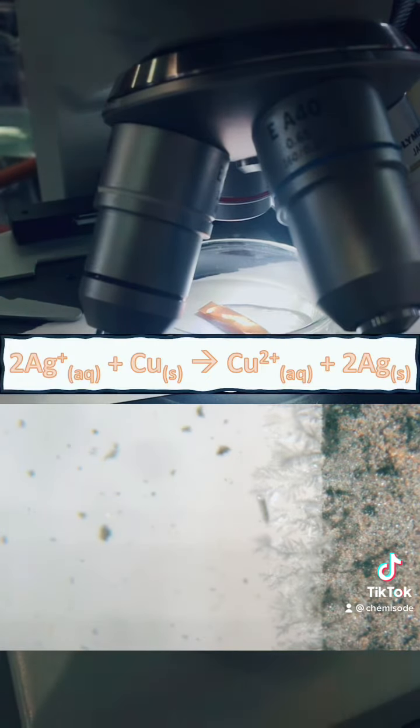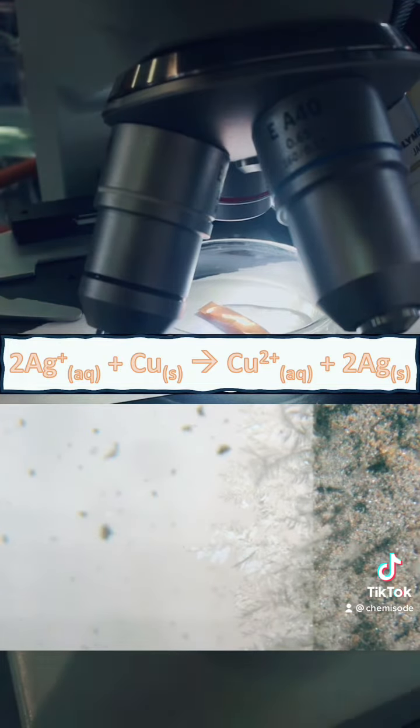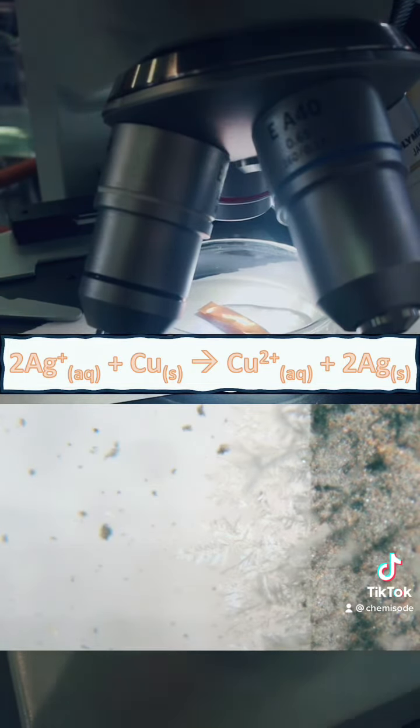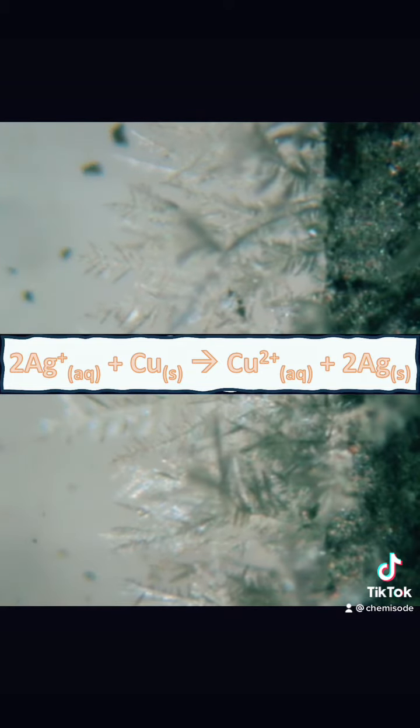So what is happening here before your very eyes? This chemical equation shows silver ions reacting with the copper metal to form copper 2+ ions and silver solid.